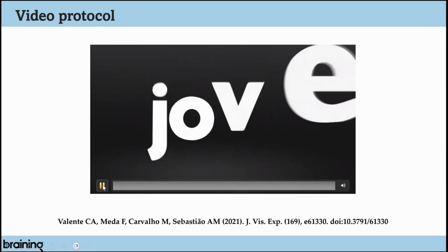And before continuing, I have here a video. So this is a video with the preparation of the organotypic slices as we do it in Lisbon. It was published in the Journal of Visualized Experiments, and I will start.